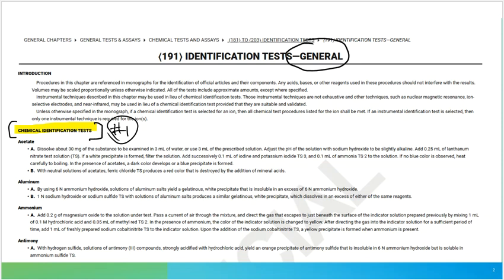Typically, these will require some type of reagent, and that reagent is going to be added to a solution of the material that I am testing. So typically things that I have to make or things that I have to order. It could be more than one thing that I have to make or order, and more than one thing can be added to these test tubes in order to get these reactions to take place. But the overall general idea is that they are chemical-based tests, which means kind of the qualitative analysis scheme that we saw in another course if you've taken that class already.